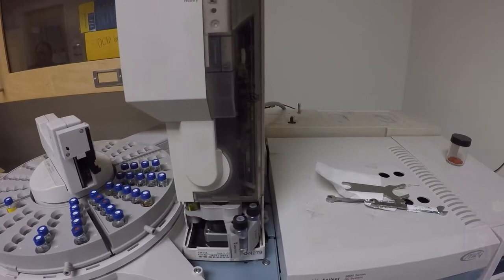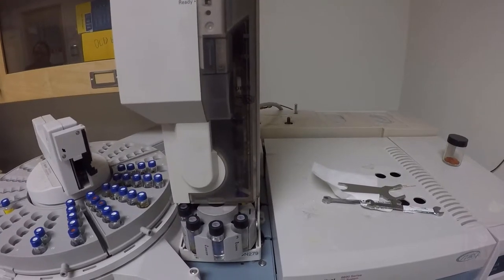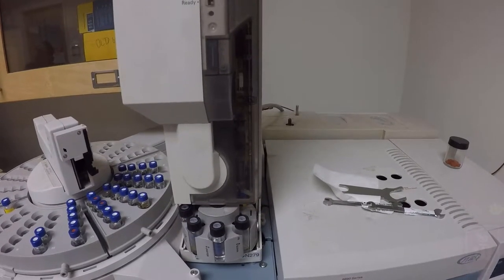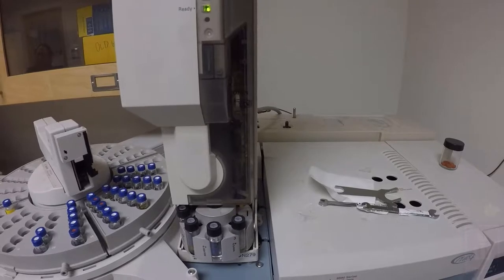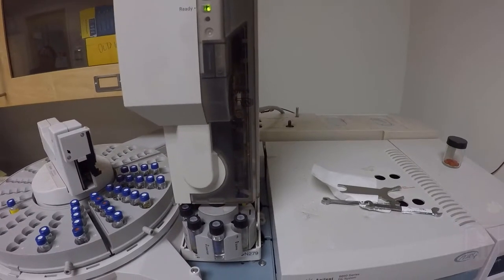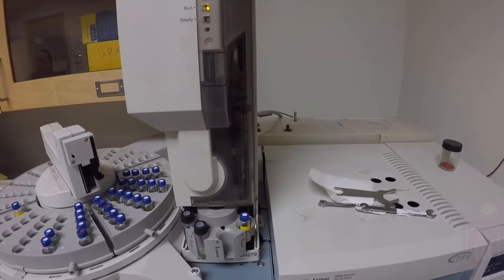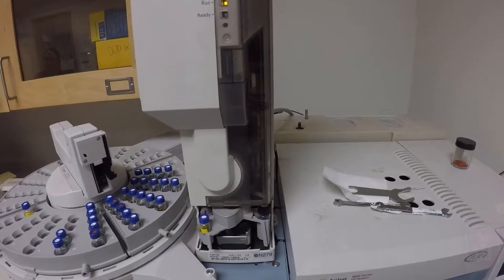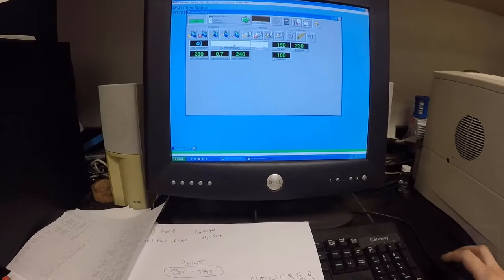Now it's into solvent two. Grabbing some of our sample. Washing the syringe with some of our sample. Now it's taking the 1 microliter we're injecting. It's going to go right onto the column, and now it's going to wash it out and clean it out for the next sample. So it's back into solvents. And now all I have to do is wait for the results. So, good luck!